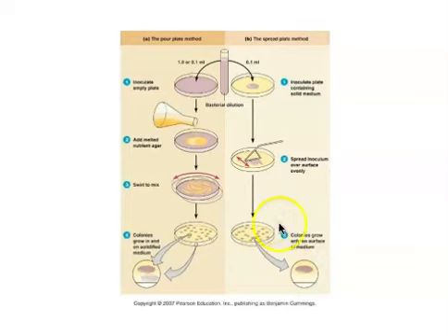In other words, when I count colonies on a plate like this, and I go to my equations to estimate how many cells are in the original sample, I won't call them cells in my final calculation. Instead, I'll call them colony-forming units, or CFUs. Now, there's a reason for this.